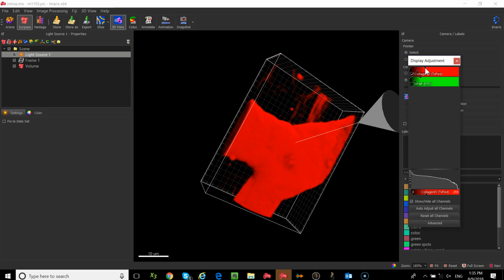Okay, so you can imagine this is all demo data we're working with. These are tiny, tiny data sets, and you can see a progress bar. So imagine a huge data set with this would take considerably longer.